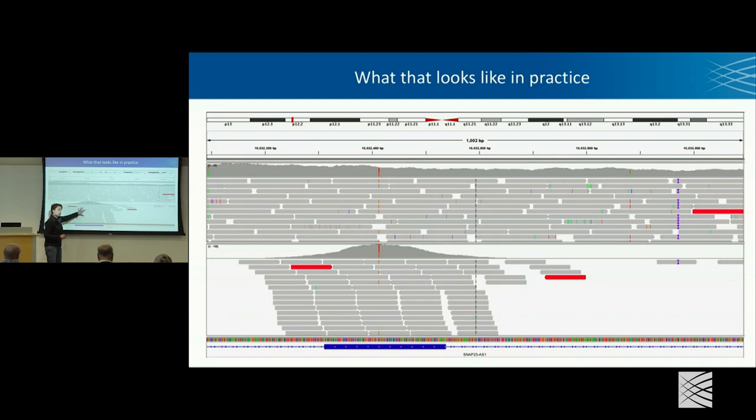So that's what we have to work with. You can see that there are a lot of little bars that don't really add up to consistent signal. There's a lot of errors that happen in the sequencing process. And so what we need is software, algorithms, that are going to identify when we have something that's likely to be real versus artifacts. Okay?